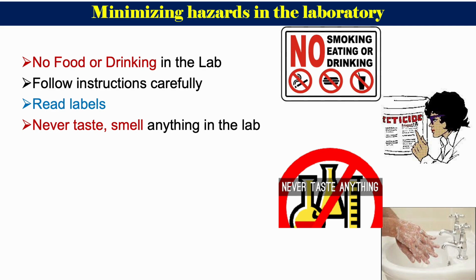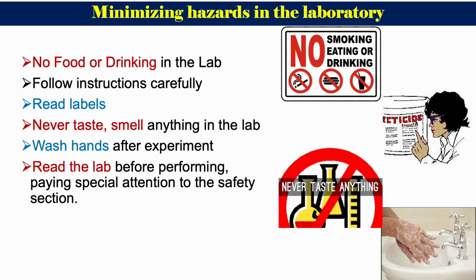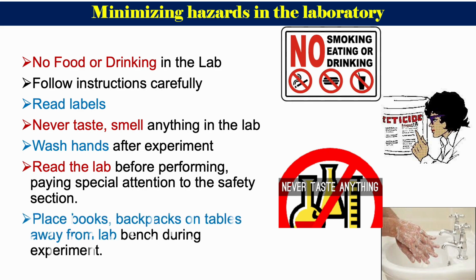You should always read the labels that are generally pasted in a particular laboratory. You should never taste or smell anything in a laboratory. Always wash your hands after each and every experiment. Please try to read the lab before performing it, paying special attention to the safety sections. Please try to place books and backpacks on tables away from the lab benches during the experiment.